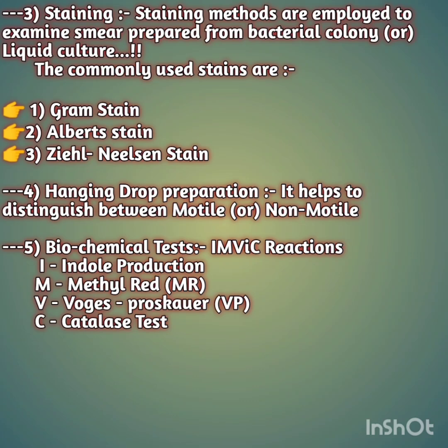Next, moving to our fourth method, that is the hanging drop method. The hanging drop method helps to distinguish between motile and non-motile bacteria or microorganisms. So this is regarding your hanging drop method.